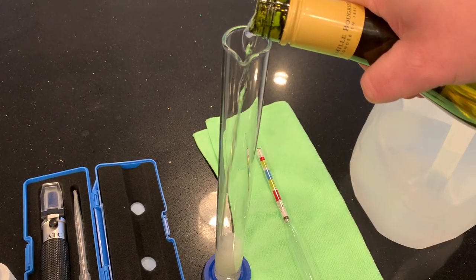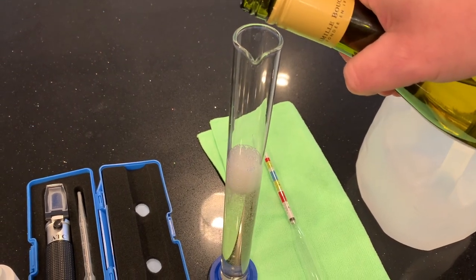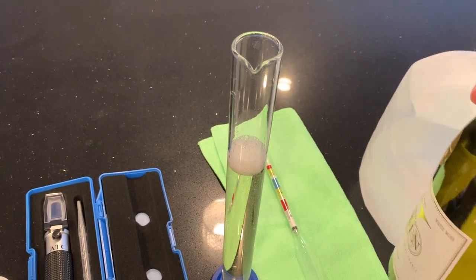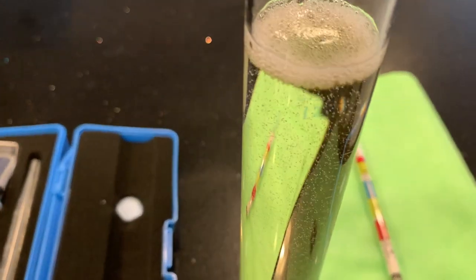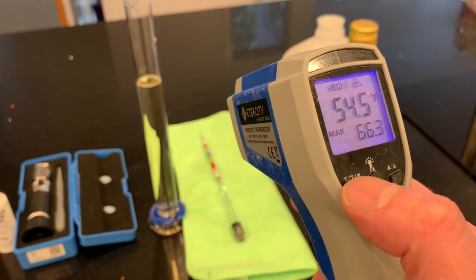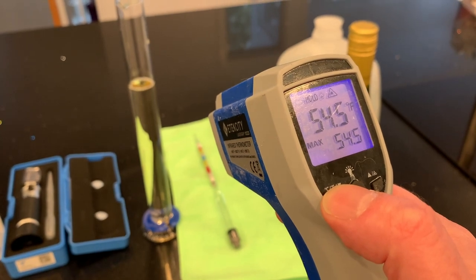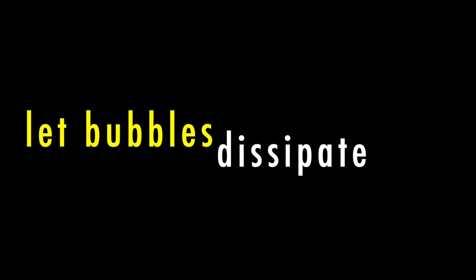I'm pouring it into my test tube here — I need at least 120 milliliters in order to use the hydrometer, and I've marked that level. I'm checking the temperature right now; it's pretty cold, so I'm going to let the bubbles dissipate and let it warm to room temperature. Hopefully that'll provide a more accurate reading.